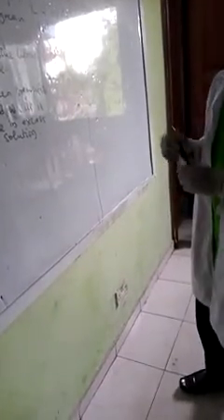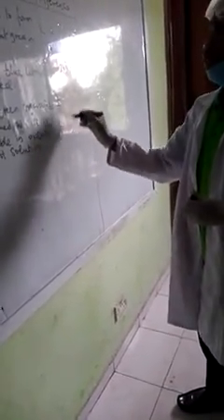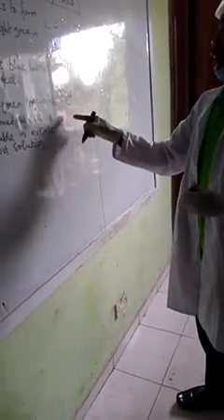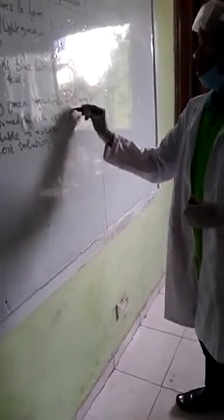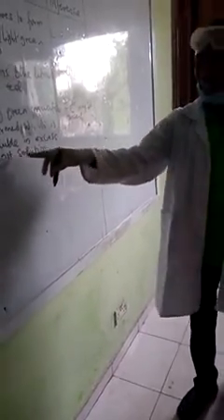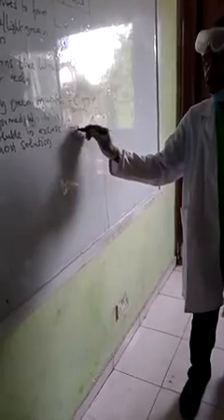What will now be the inference? When we added in drops and a dirty green precipitate is formed, the inference there will be what? Iron 2 ion may be present. Then, when we now add excess and it is insoluble, you now say what?